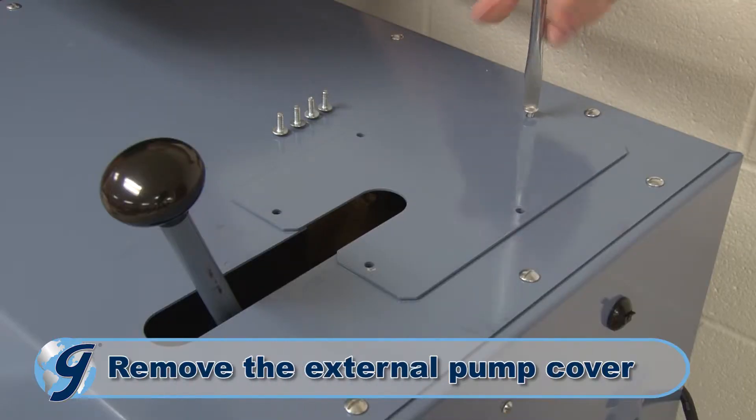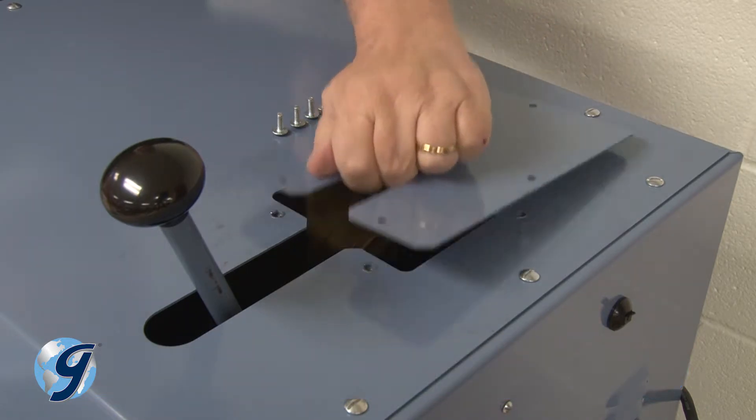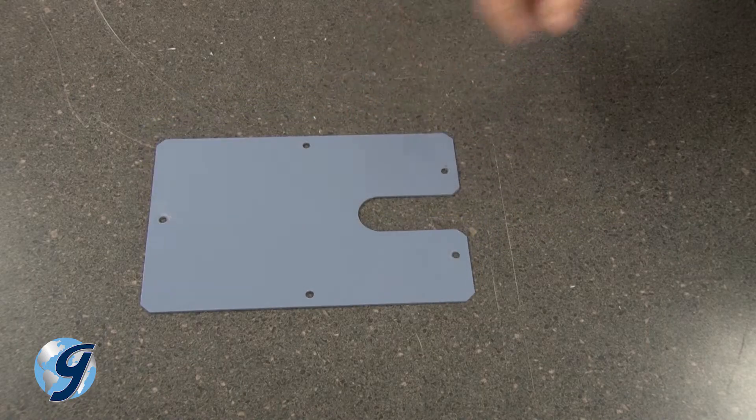Next, remove the five screws that secure the external pump cover to the top cover. Then lift the external pump cover off and safely set it and the screws aside.